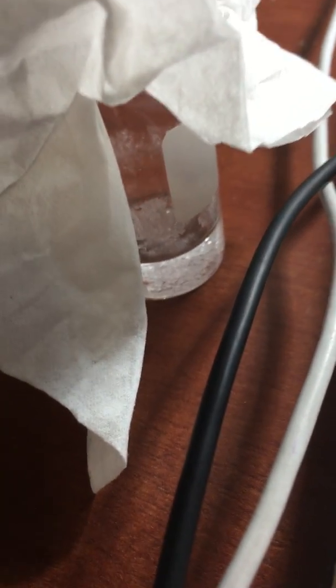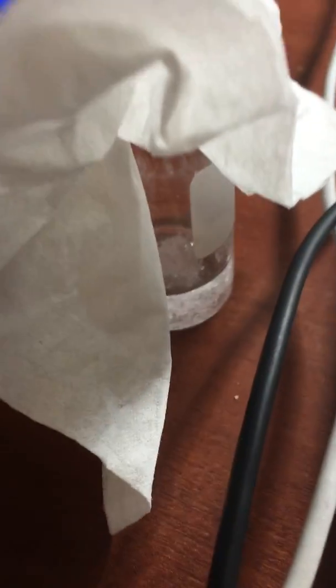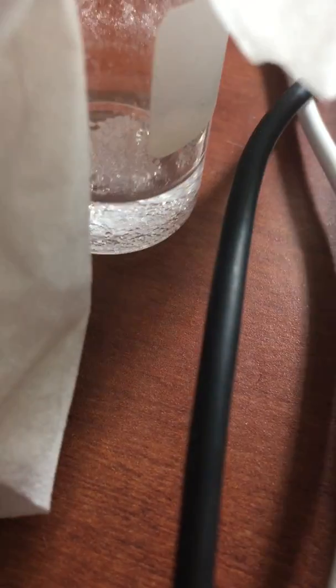It's Richard here. So today I'm gonna comment on the alum crystal growth. So far, as you can see from this little vial here, the crystal has been growing quite a lot. You can see there are a lot of crystals on the wall of the little vial as well as on the bottom of the vial.